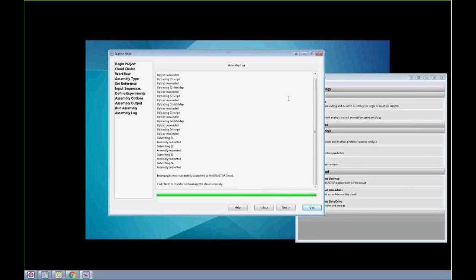Thanks, Katie. We have a couple more questions, but I'm going to hold those until after the next part of the demo. So you can go ahead and continue with your demo. Thank you. Okay, great. Yeah, thank you. Yeah, please continue to ask questions. We have some analysis steps to look at, but we'll take the rest of your questions at the end.